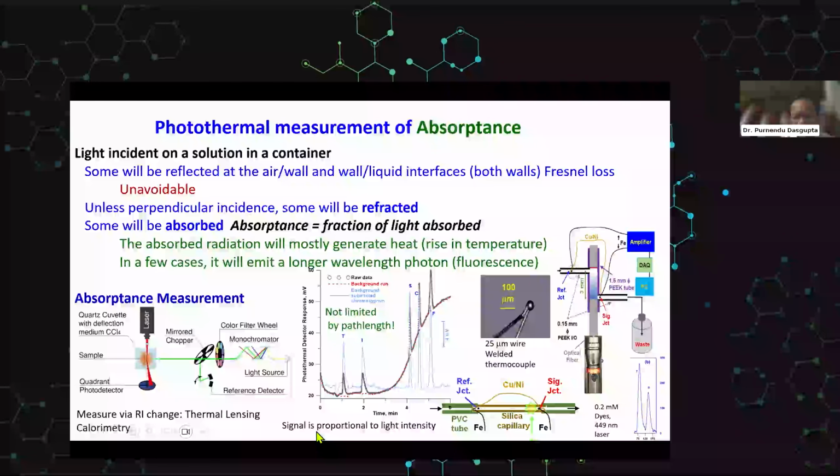Okay, so this is a chromatogram with a white LED. There's no monochromator. These are 5 different dyes. They absorb in different colors of the region, but they absorb somewhere in that white spectrum. They all produce signals. During a gradient, you also change the composition of the solvent. The specific heat changes, and that changes the background. If you subtract the background, you can get a flat chromatogram.